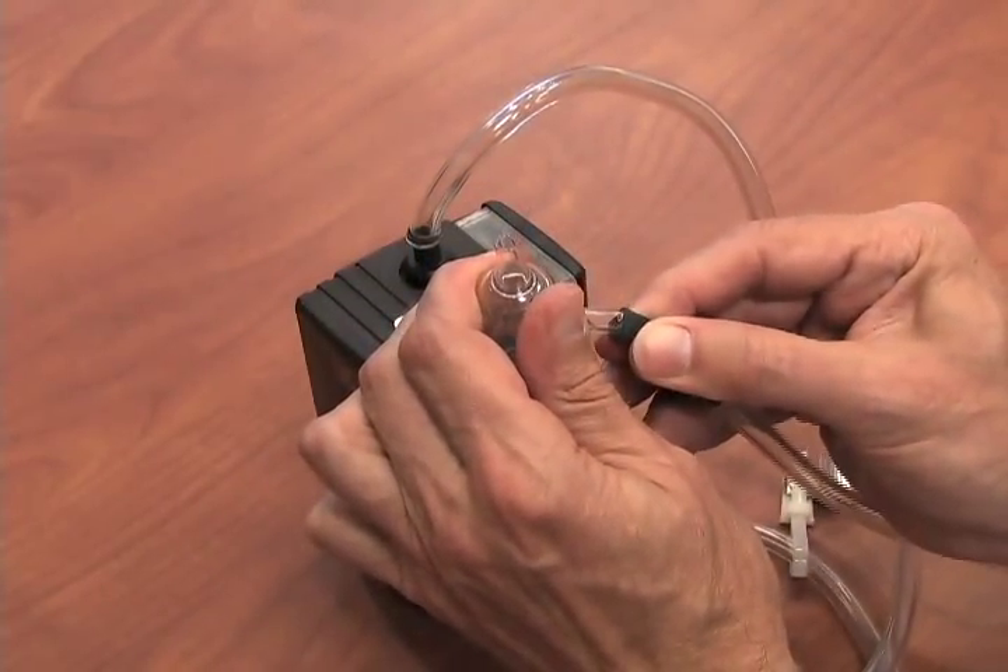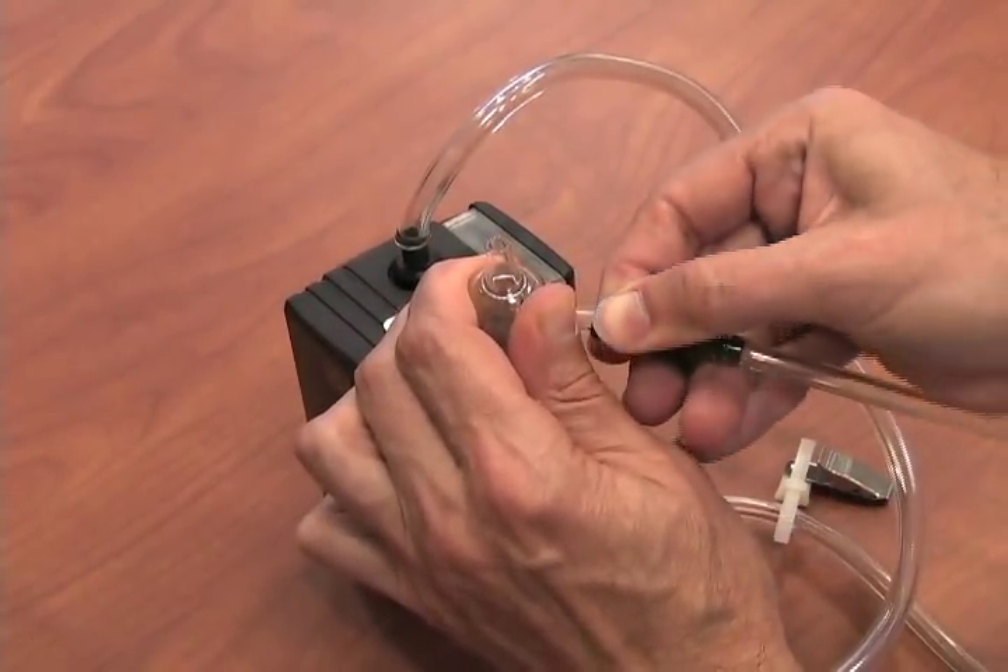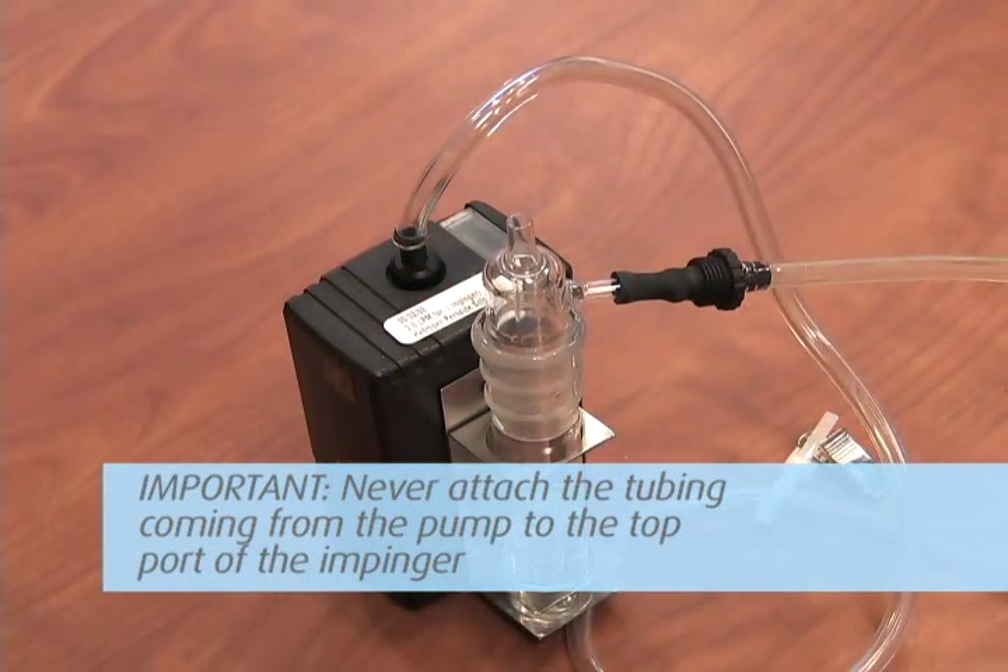Attach the Tigon tubing to the pump and then to the side port of the impinger. Important! Never attach the tubing coming from the pump to the top port of the impinger. This will cause solution to be drawn into the pump, resulting in failure and damage to the pump.